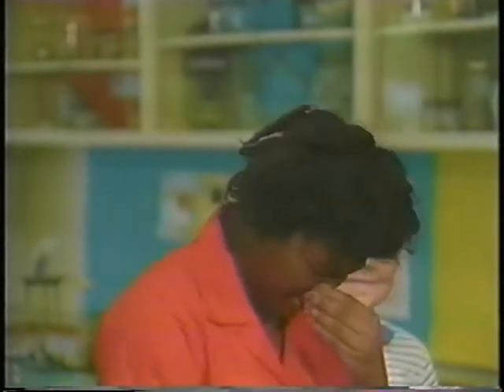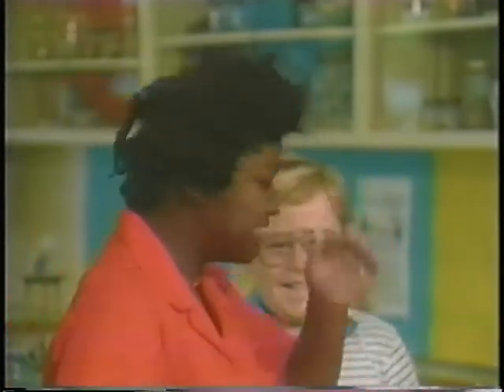Now, it may seem kind of dumb having to do this, but if you've ever stuck your nose directly into a beaker with household ammonia in it or ammonium hydroxide, I'm sure you'll agree with me that the best way to smell something is the proper scientific way. Now, there are two other types of chemicals that are real nasty, acids and bases. Let's take a look at acids and first see how to properly pour an acid.